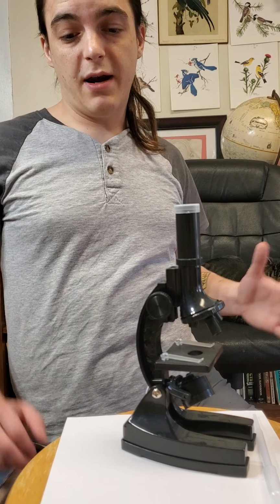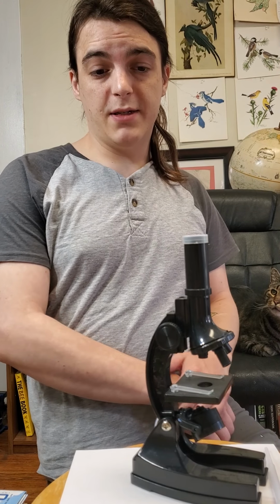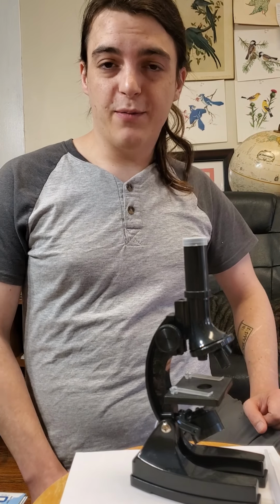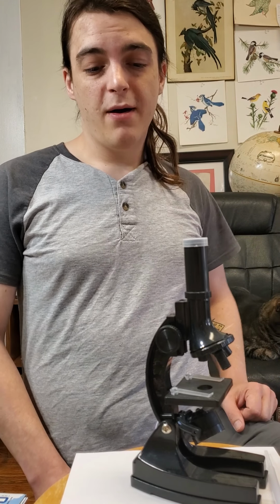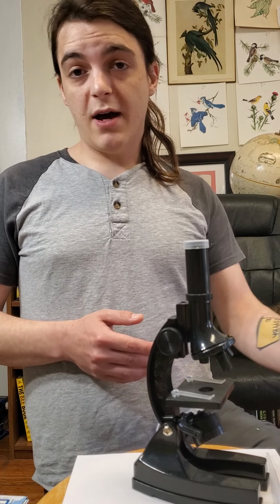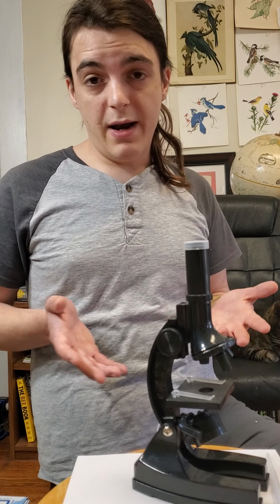All right, so what we're going to do today, since we talked a little bit about microscopes last week and we got a nice long week again, I'm going to have you guys write me some notes once again. Instead of my laser microscope, which I didn't invent, I got it from a SciShow video a long time ago, today we're going to talk about a more traditional microscope that some of you might have around the house, some of you might not.